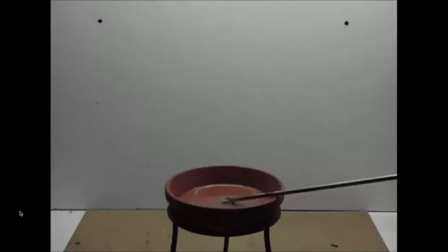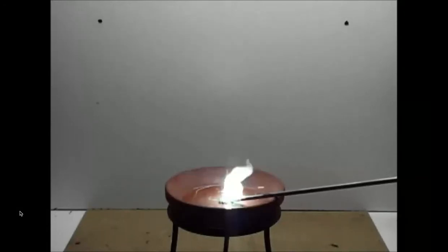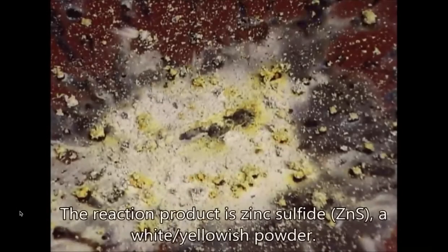So definitely evidence of a chemical reaction going on there. It was in slow motion. We can see that this is a highly exothermic reaction, meaning that when the bonds were created between zinc and sulfur, it released a lot of heat energy.